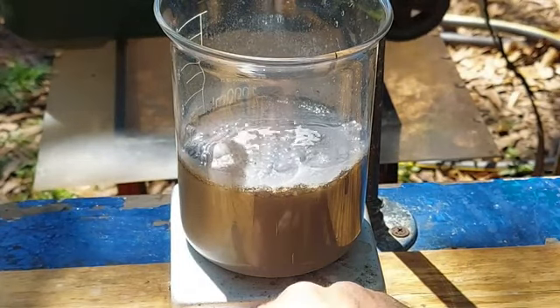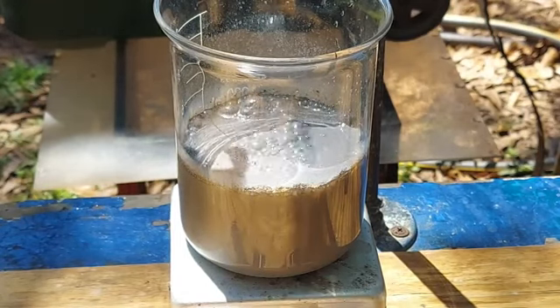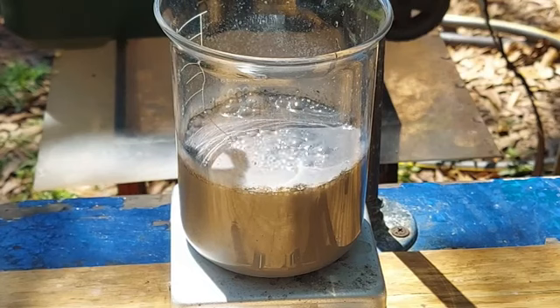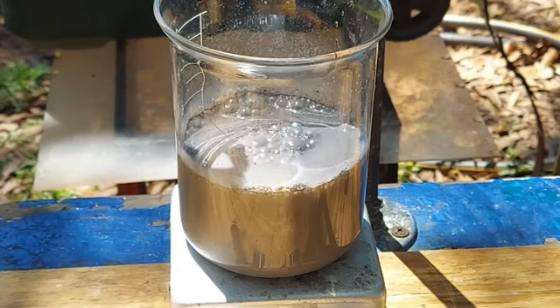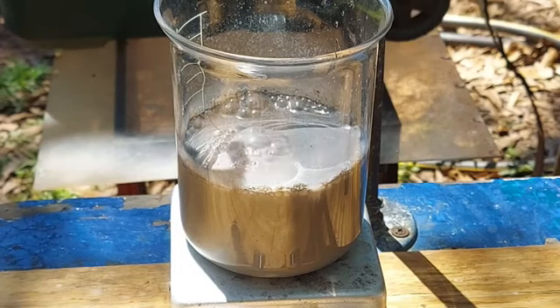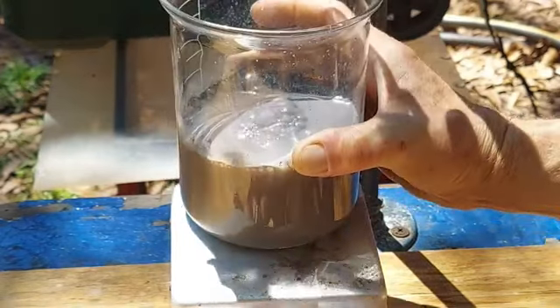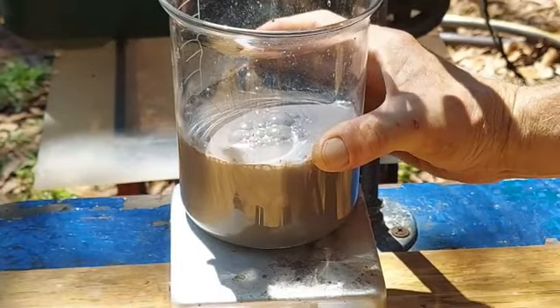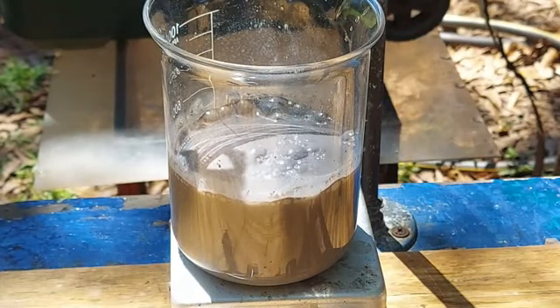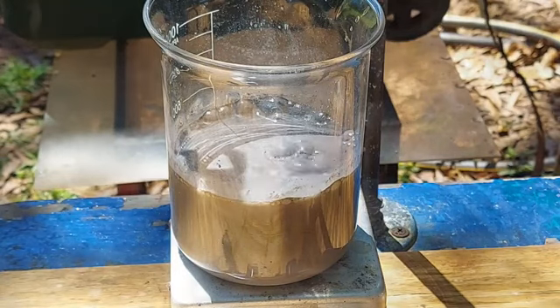And I'd love to be able to stir it more vigorously than this, but if I try to, the stir bar will get thrown off to the side, and then I'll have the fun of having this still quietly fizzing while I've got to sit there and try to get the stir bar in place. And here we go, right on cue. I hate this stir plate. I hate it. When it finally dies and its usefulness is done, I am going to invent new ways of destroying it. I am going to come up with something truly epic for this one. I don't know what, but it's going to be something to behold.